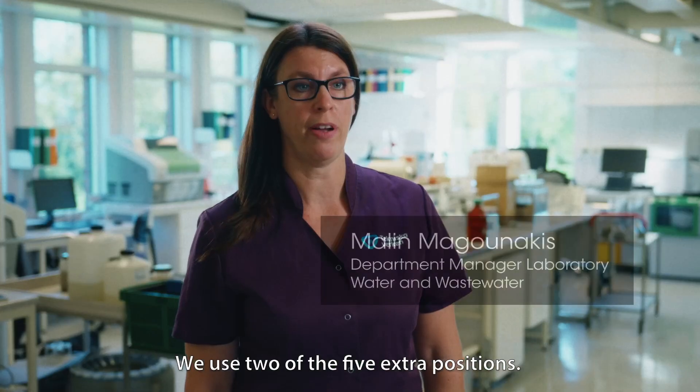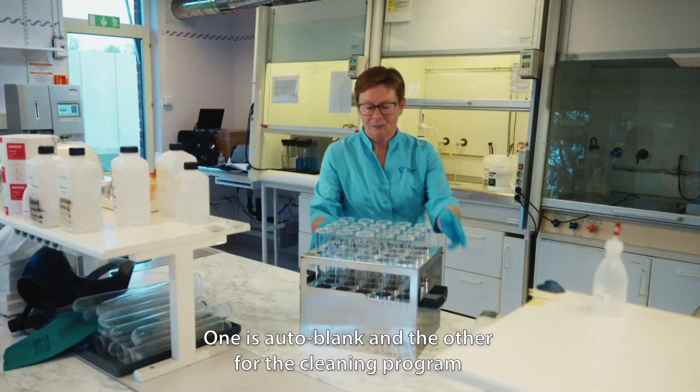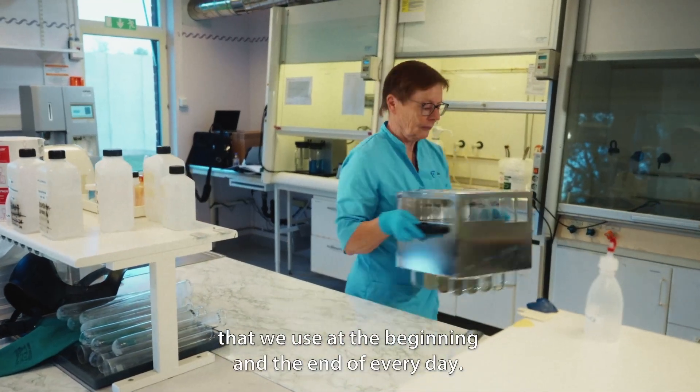We use two of the five extra positions. One is Auto Blank and the other for the cleaning program that we use at the beginning and the end of every day.